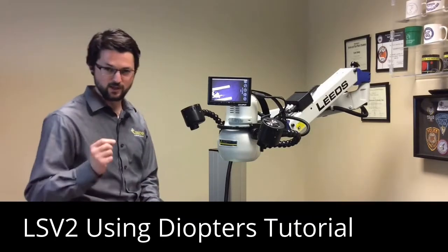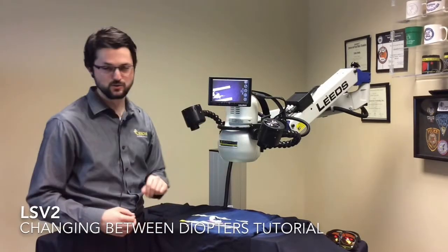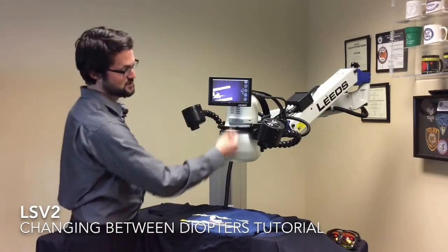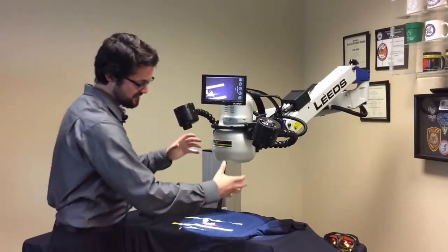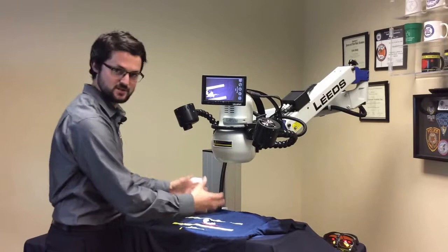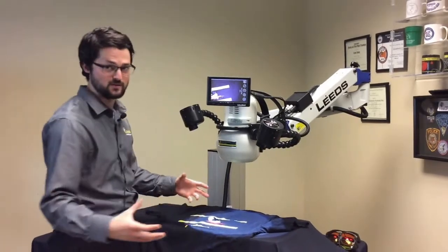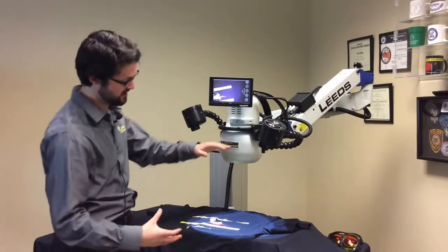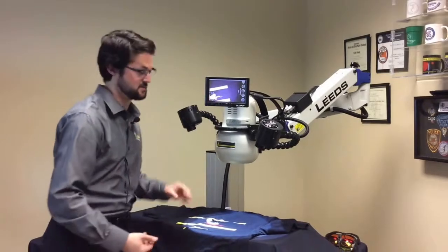But let's say you want to get really close and magnify things beyond what you can zoom in with the plus 2 diopter. What I can do is in my diopter selection, choose the plus 3.5. This is going to allow me to physically bring the head closer to the sample, which is going to both magnify things and also make the system more sensitive to light, because being physically closer means the light has less distance to travel back to the lens system.